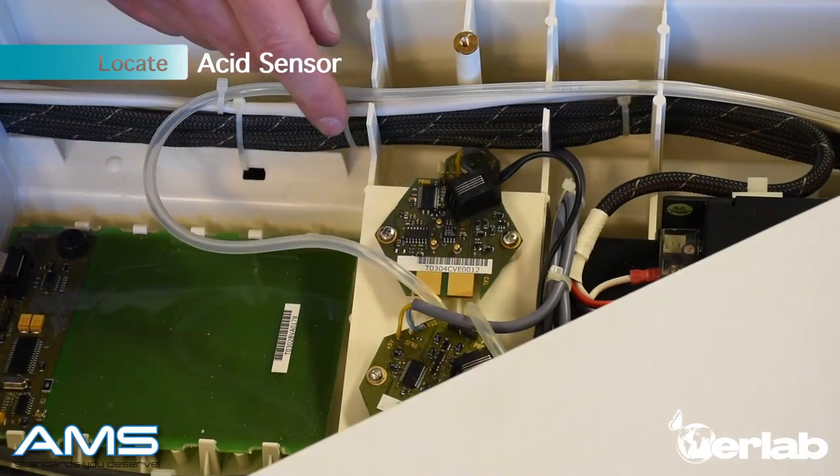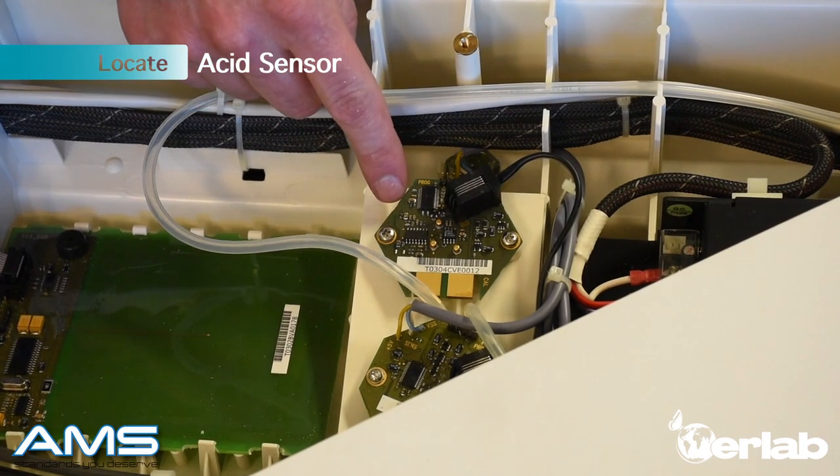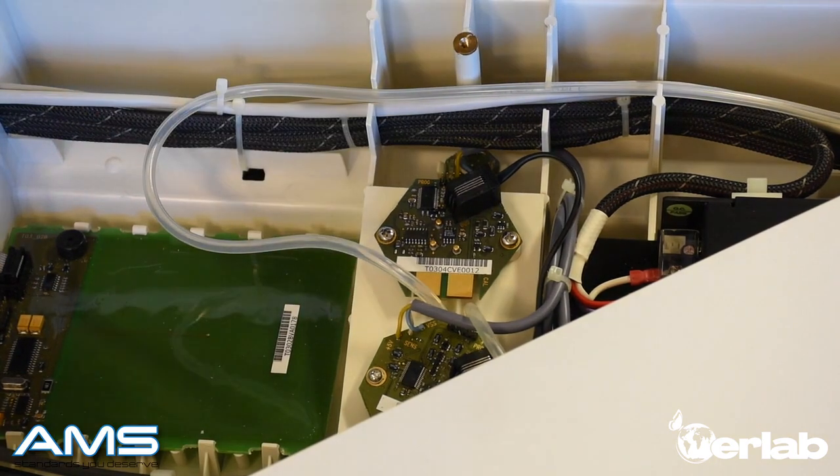You're going to locate which sensor is the correct one. The first sensor — the six-sided hexagon sensor — is the acid sensor. The octagon sensor is not the correct sensor.